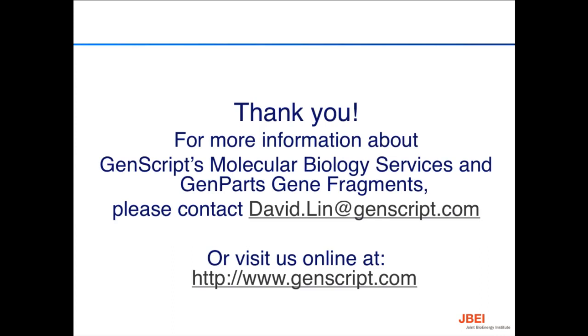Oh, and we do have one more question. This is from Donatus, and they ask about commercial assembly kits. There's a whole bunch of them out there, like Golden Gate and Gibson and all these commercial kits. Do you have any thoughts on them, or do you prefer one or the other?